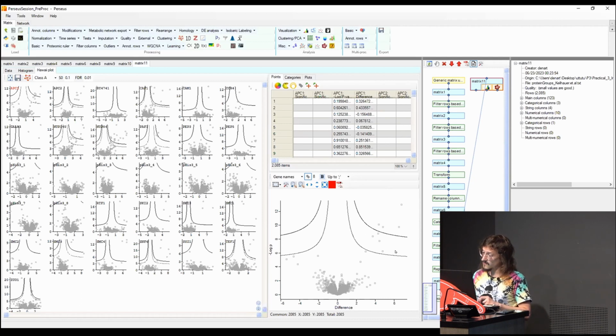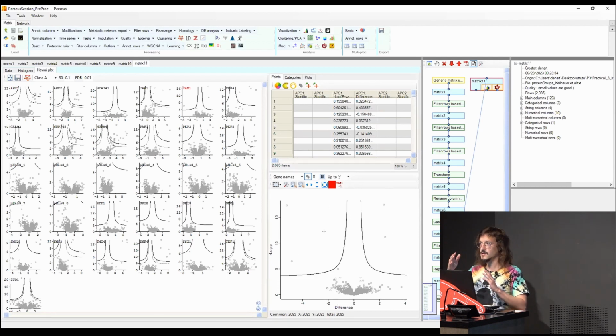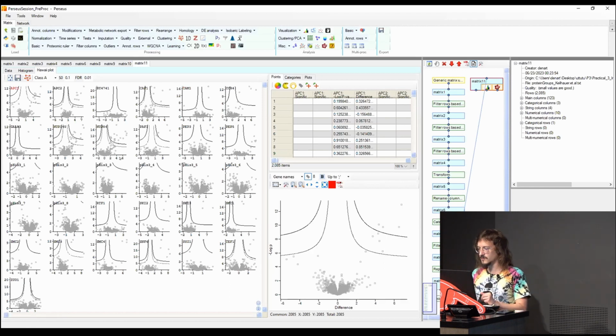So yeah, these different lines allow you to see, in this case, these 2 proteins, and these are errors actually, but these 2 proteins here are so significant that we don't need to check between different p-values. Here they're all very close together, so then you see these 2 lines starting to get more distant. And what I would recommend you to do in this case, take those 4 proteins here and check the correlation with the profile plot.